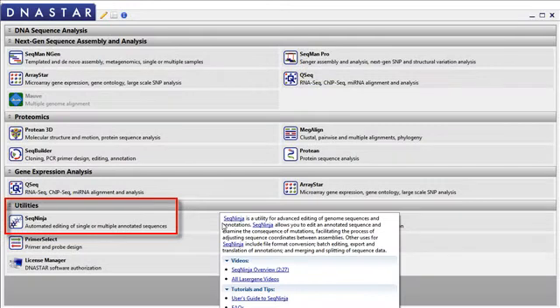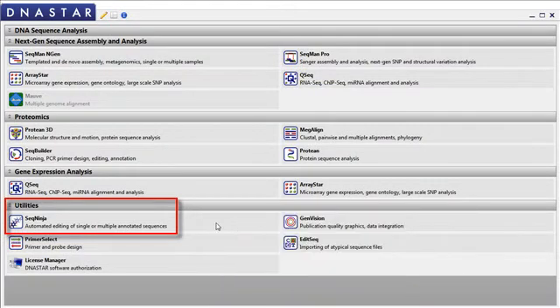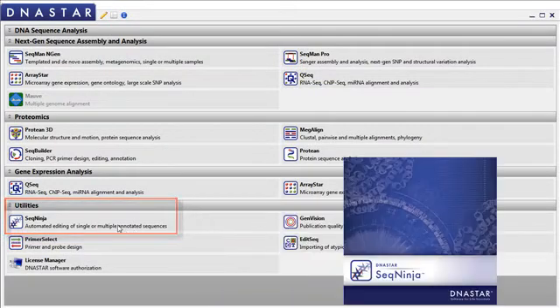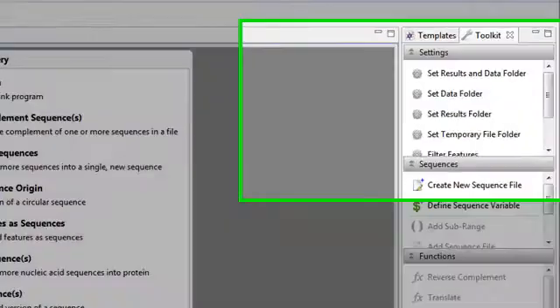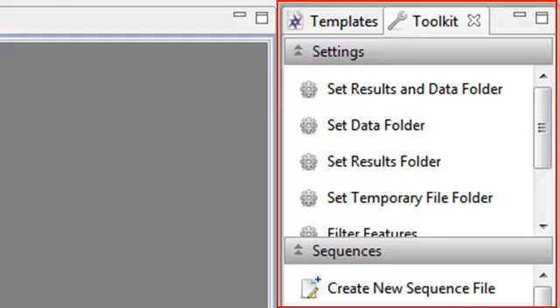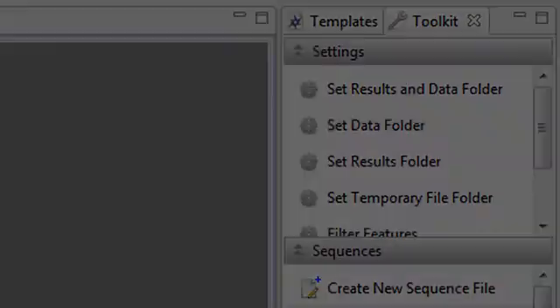SeqNinja is the laser gene core suite's utility for advanced editing of genome sequences and annotations. When you first launch SeqNinja, the template and toolkit panels appear on the right.